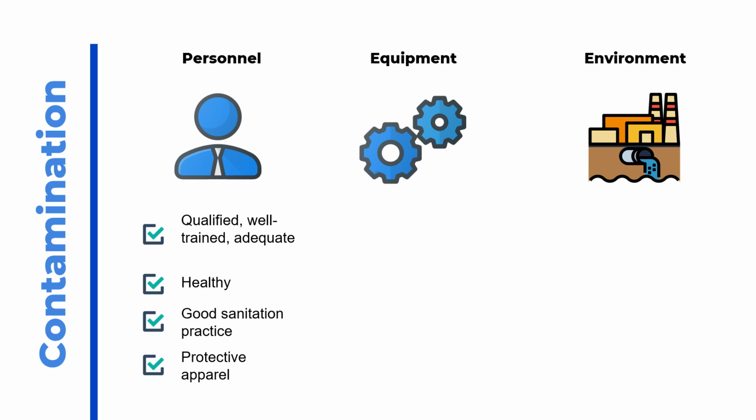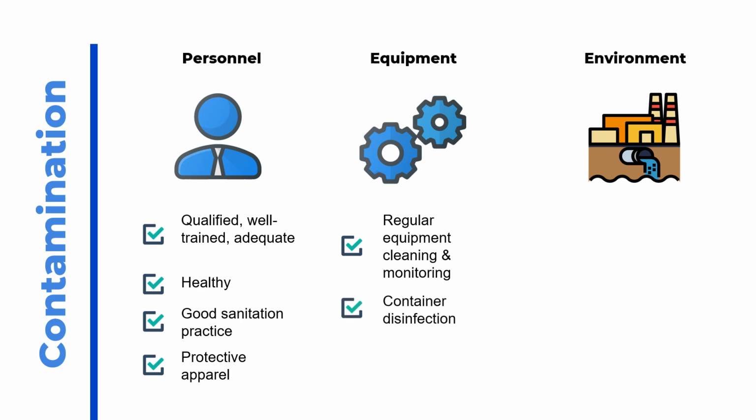Particulate matters can be obtained from the equipment. Thus, any instruments and utensils should be cleaned and monitored regularly. Disinfectant can be used to clean these equipments. Plastic containers can be pre-sterilized by multiple water for injection rinses to prevent pathogen contamination.